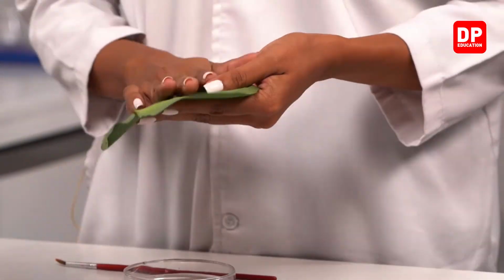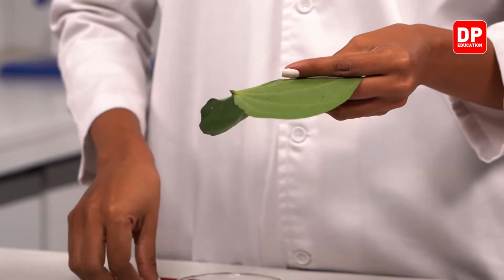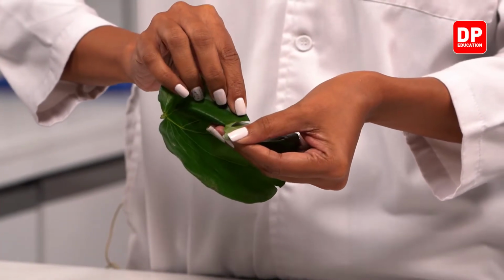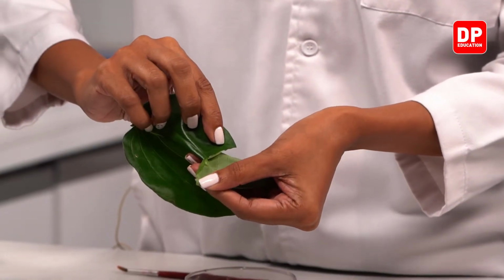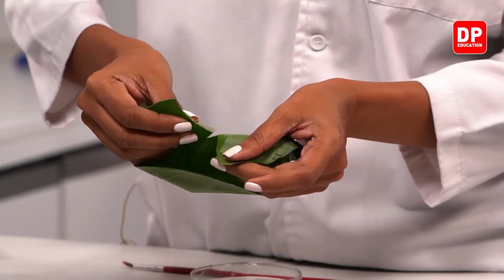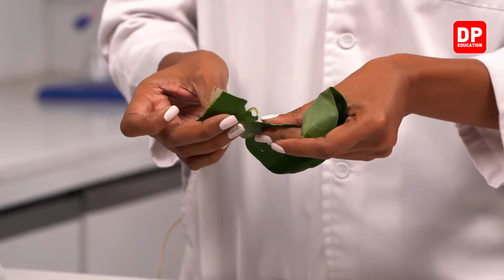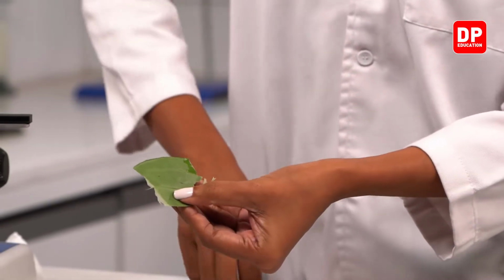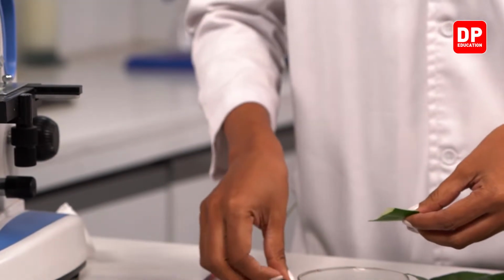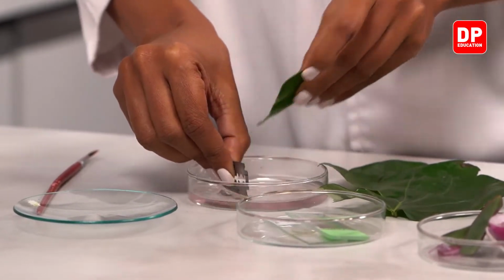Now we are going to make a specimen of the lower epidermal tissue of the betel leaf, right? So we need to take the leaf in the same way. I'll try to tear. Okay, so when I tear it like this, remember we need to obtain a very thin layer. Otherwise we can't. If there are many cell layers, we can't observe it, okay? So you all can see this thin part. I'm going to take a piece from this very thin part, okay? See? Right.